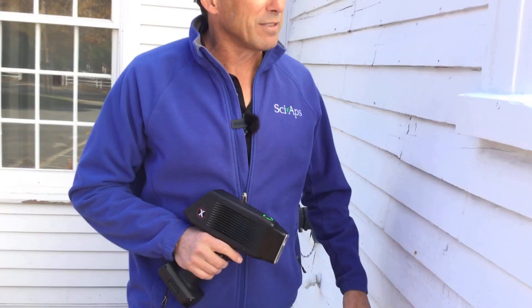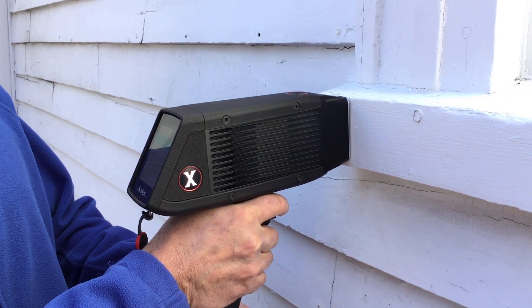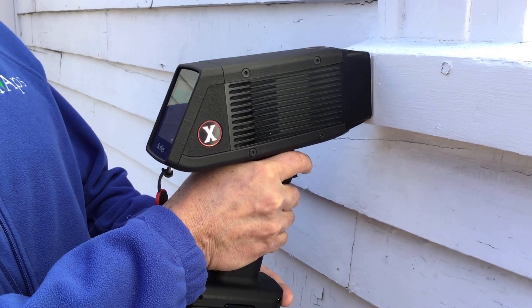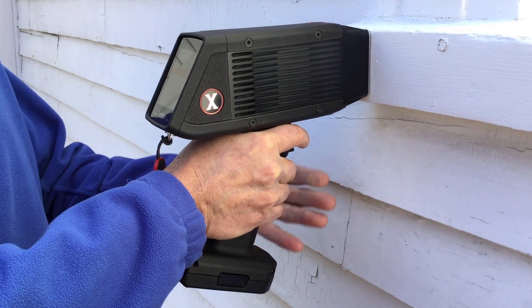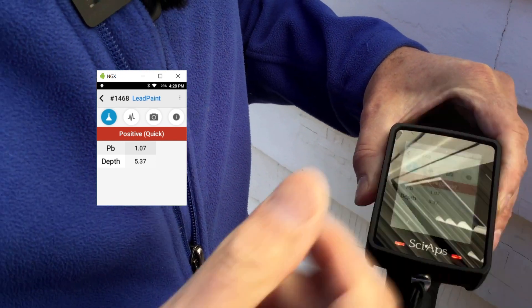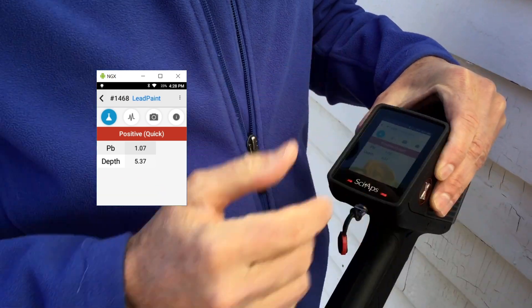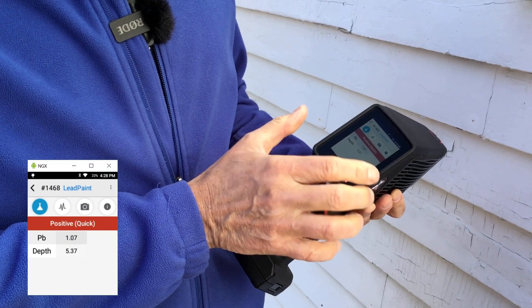Let's take this spot and see what we've got here. This will be one of your longer tests because the lead level is very close to the action level, and the depth factor — which we'll explain in a second — is about five. This is reading 1468, and it came out as a positive 1.07 milligrams per square centimeter, so it's positive compared to the 1.0 federal standard. That five-point-something depth factor is an indication that the lead is underneath many, many layers of non-lead paint — probably at least 10 to 20 coats of paint on top of the lead paint. So that's a great example of lead right around the action level with a high depth factor.